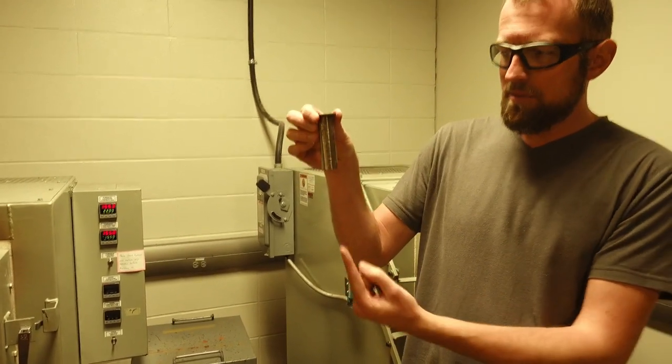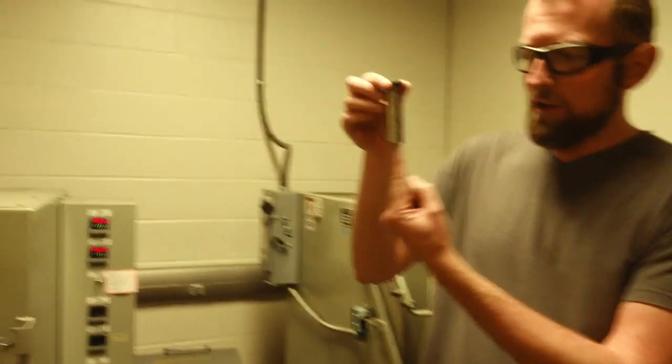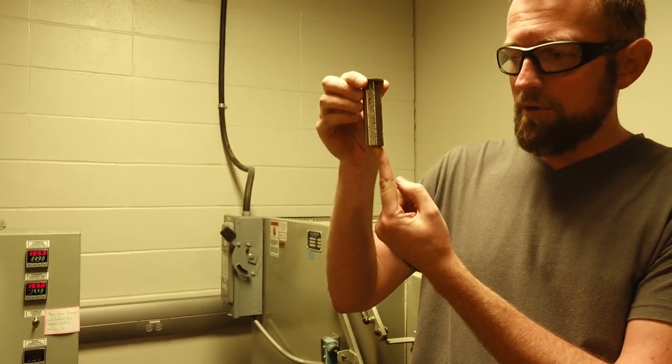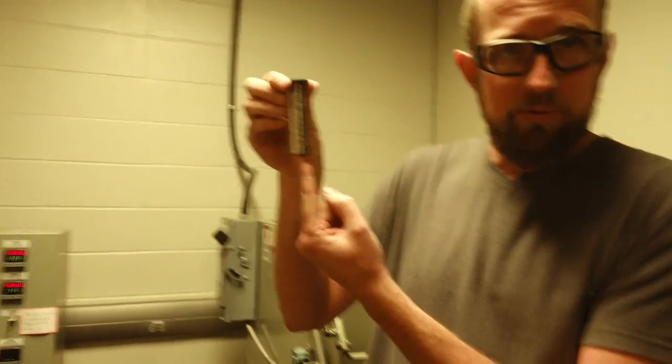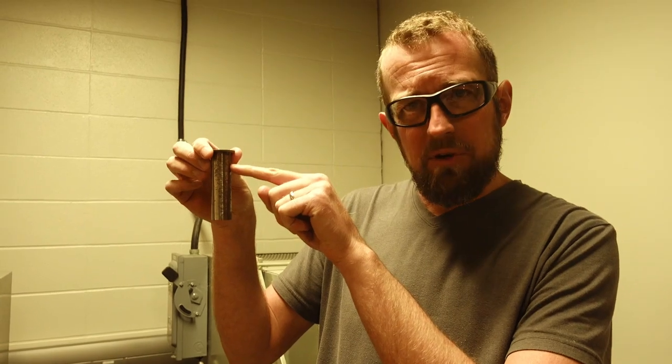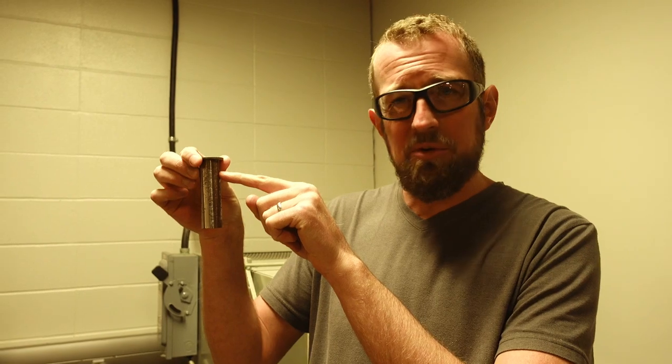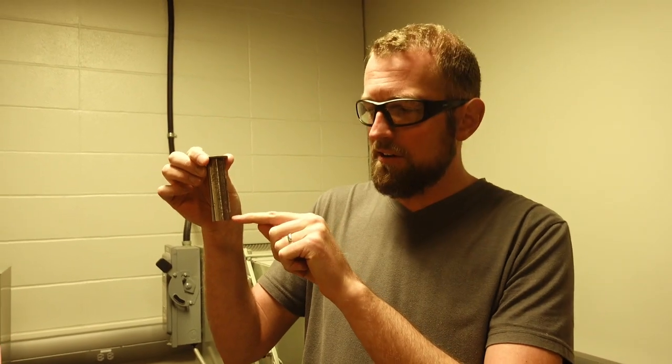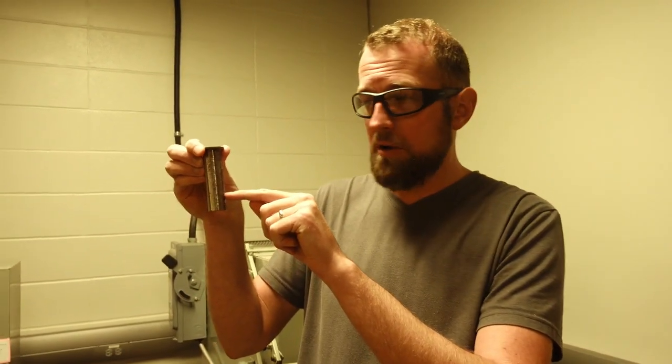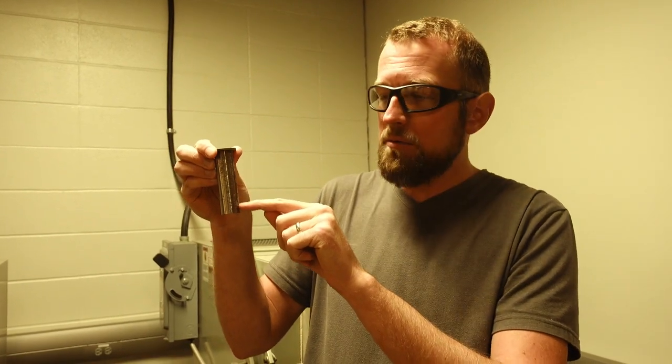The idea is I'm going to take this bar and just quench it from the bottom. And as I quench it just from the bottom here, the part where the water is in contact with should form martensite. But is it going to form martensite up here? Probably not, because this whole region is just air cooled basically. It should be forming ferrite. The real question is where does the martensite start? Depends how deep that martensite goes. That's going to tell me how easy it is to form martensite. How fast a cooling rate do I need to form martensite?